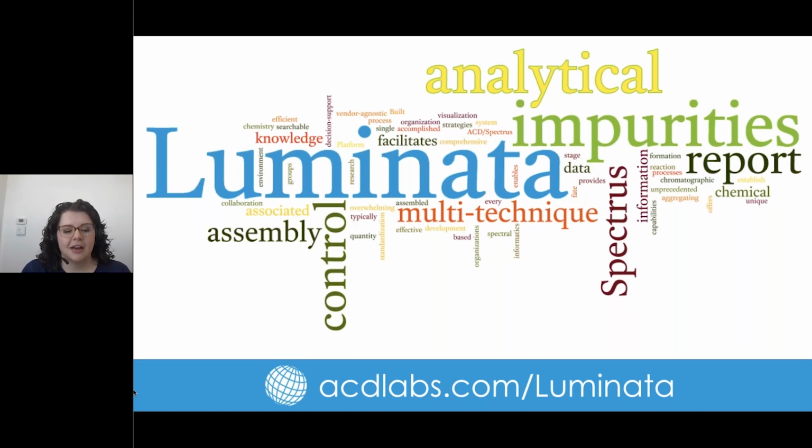Okay. All right. And then a bit of a broader one here. So your talk was mainly focused on pharmaceutical applications, but you also have experience with consumer packaged goods, and food and beverage firms. So are there concerns about product impurities and contaminants similar in those institutions? And do you think these sectors can learn from each other with respect to impurity control? Certainly, the answer there is yes.